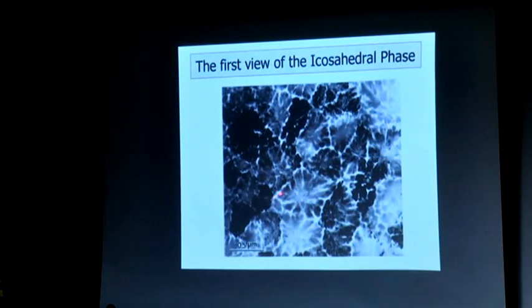We see here crystals. This is one crystal. Here is another crystal. Here's another. They're small. This is half a micron. So the crystals are of the order of 1 micron or even less than that. But some of these crystals were pitch black. See this one? And this, and this, and this, and this.